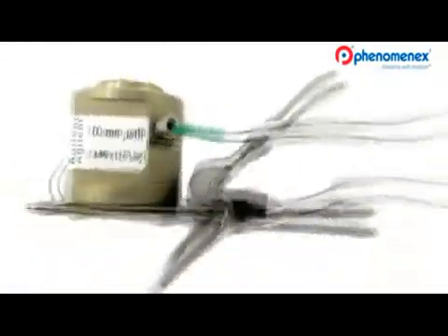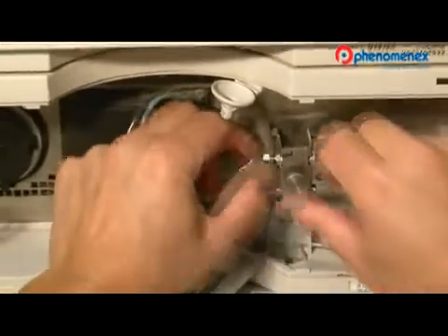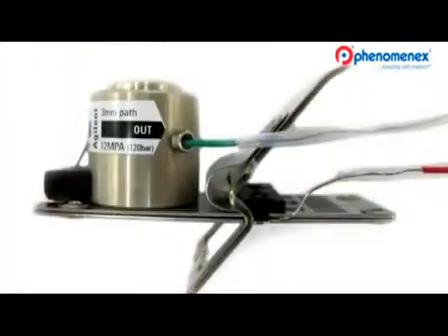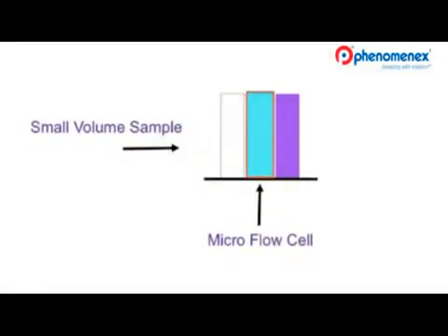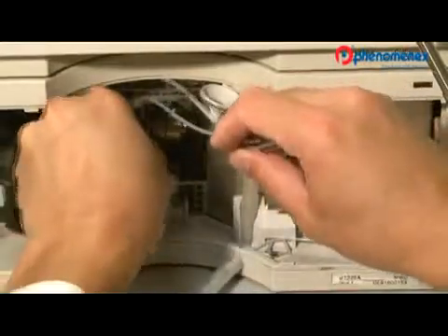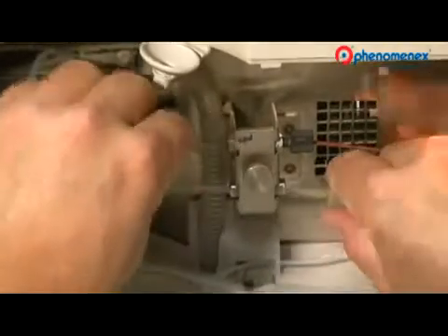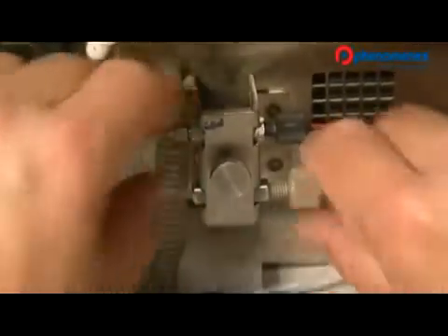Let's remove that large volume flow cell. With the detector turned off, I'm disconnecting the inlet and the outlet lines of the current flow cell. Once the lines are disconnected, removing the flow cell is really easy. You will replace the large volume flow cell with a 3-millimeter flow cell — a smaller flow cell will maintain the integrity of the high-efficiency Kinetics peak. I'll put the newer low volume flow cell into its position, and it snaps right in. Close the door, then it's just a reconnection of the lines, and with a quarter turn at the end — there.